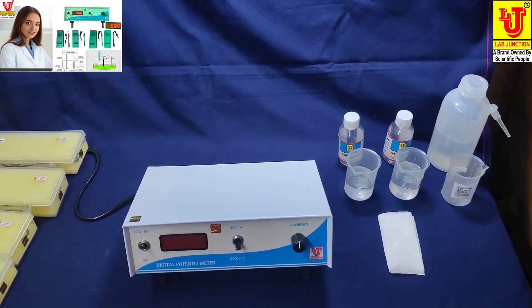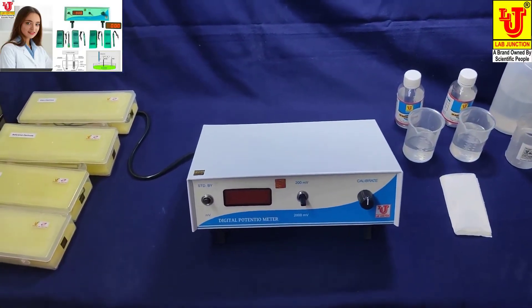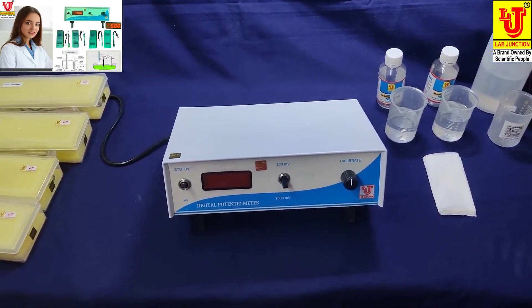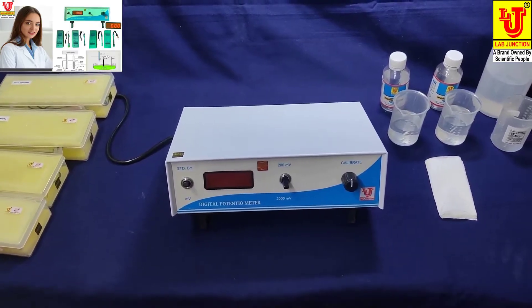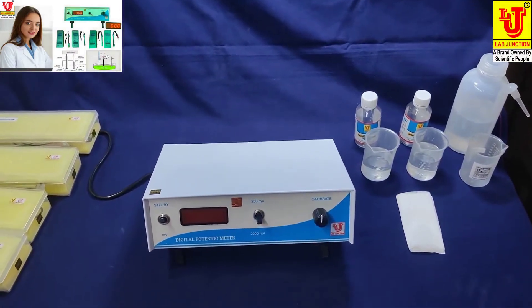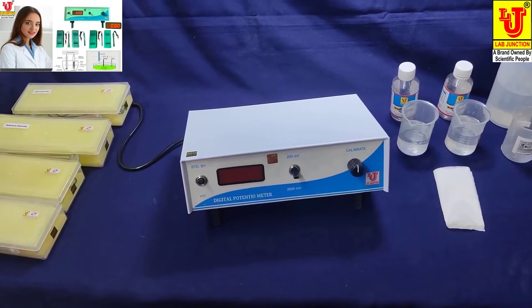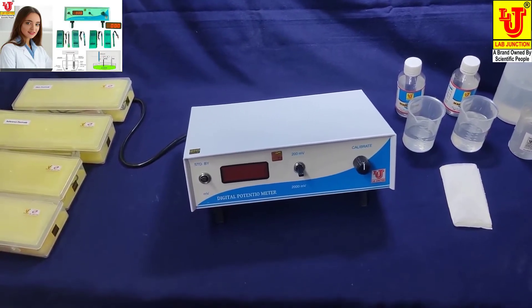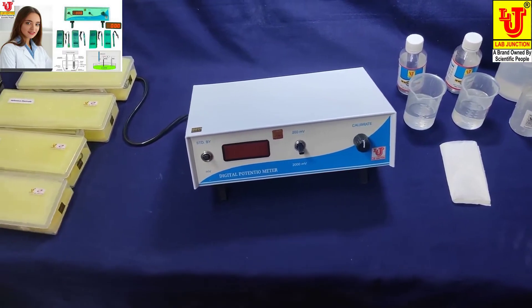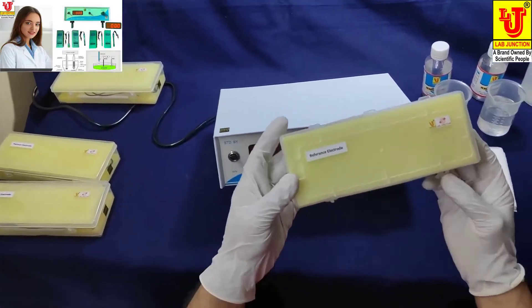Lab Junction digital potentiometer model LJ-118. We have two models in digital potentiometer: LJ-118 and LJ-119. This is our model LJ-118 digital potentiometer. With this instrument, we supply accessories including electrodes and a reference electrode.